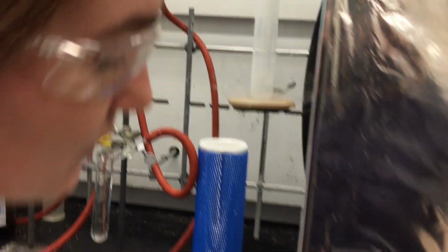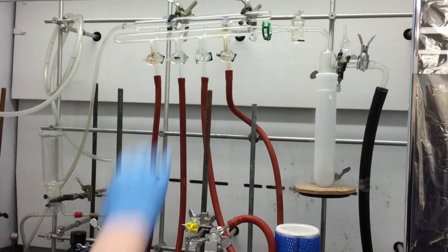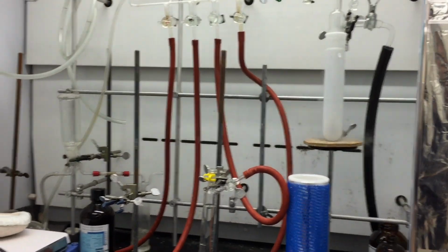So now we can turn the vacuum off and vent it. Now that that has been vented, we can also vent our Schlenk line. So we're going to open up this tap again. And there you have it, how to freeze pump thaw.